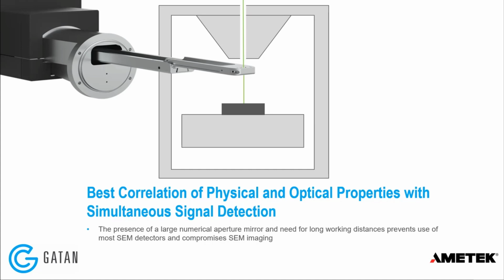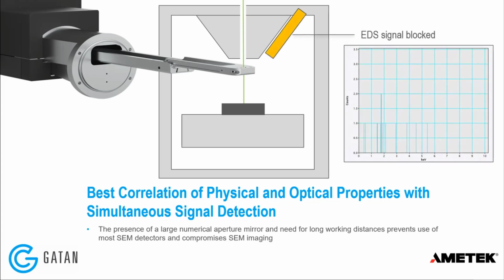But one of the consequences or downsides of using such a large collection mirror to make cathodoluminescence microscopy possible is that it blocks line of sight to many of the other detectors that you have in your electron microscope. So that could be the EDS detector, such as I have illustrated here, or a pole piece mounted backscatter electron detector, or it could be the in-lens detector. So you're often limited to working at 10, 12, 15, on some systems even 20 millimeters, which precludes the use of those in-lens detectors.